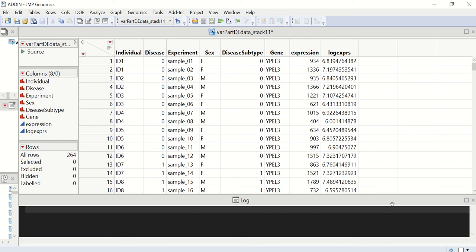This is a genetics data example. We have RNA sequencing gene expression values, as well as the log transformed expression values available.